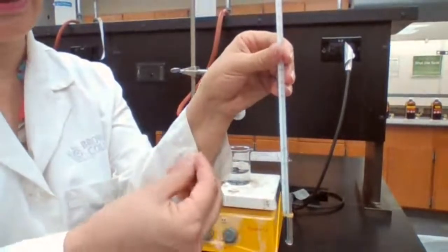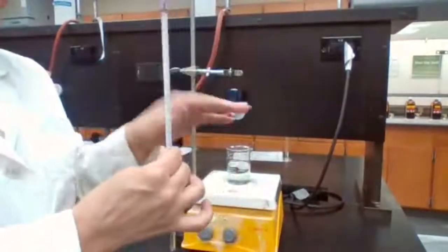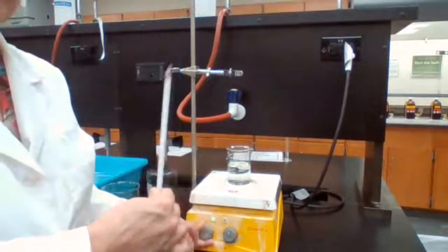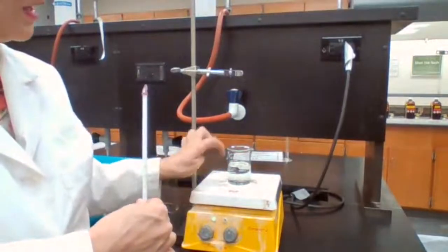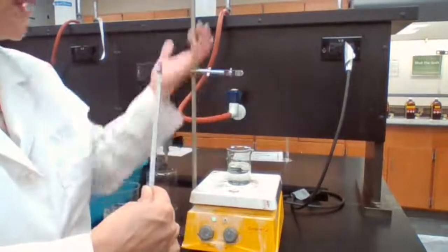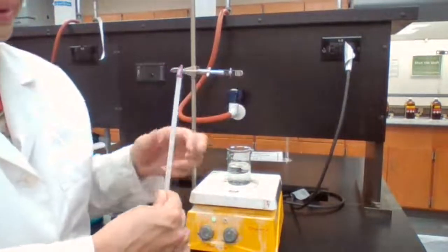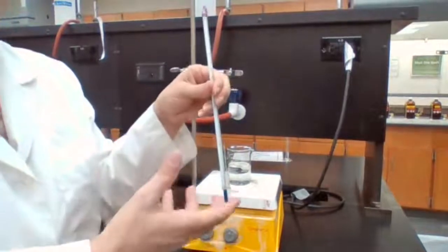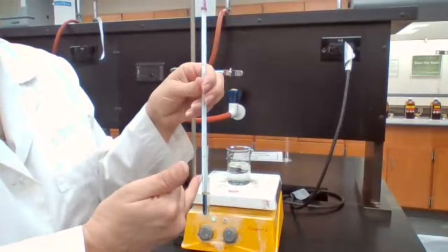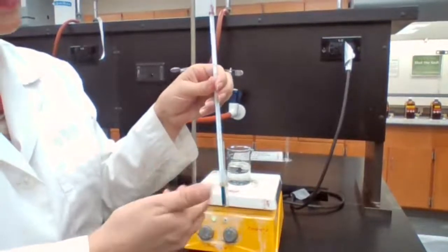That's the time that the liquid starts boiling, and we can stop the boiling. We can remove this, but since the hot plate is hot, if I turn it off, it's still going to be hot. The better practice, if I was using a Bunsen burner, is to turn off the burner and wait for the bubbles to stop. Before the liquid goes back into the capillary tube, it's going to be the exact boiling point.